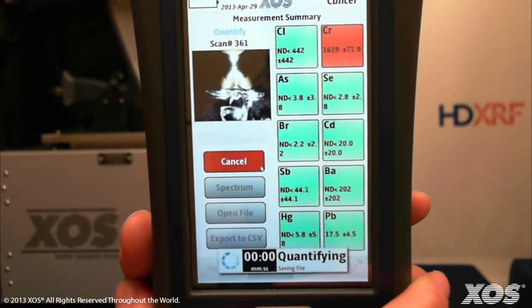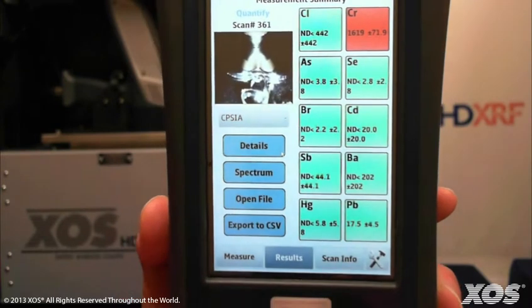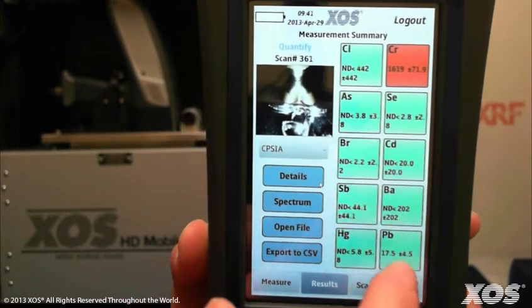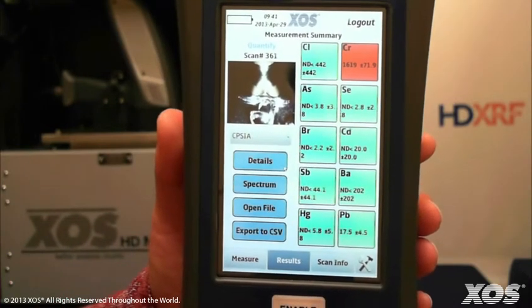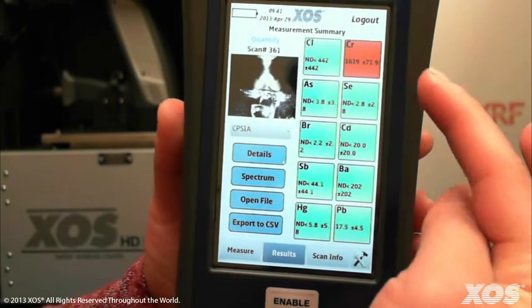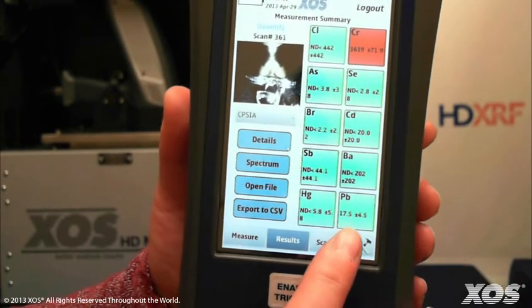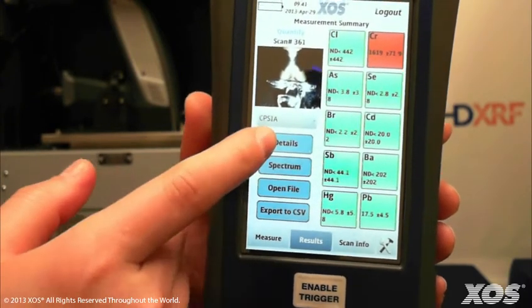The color-coded boxes on the screen will turn red based on the factory-set CPSIA limits, or you can create a limit set of your own to determine what level of lead and other heavy metals are acceptable for your application. For this sample, over 15,000 ppm of chromium was detected, so the box is red. Only 17.5 ppm of lead was detected, so the box for lead is green.